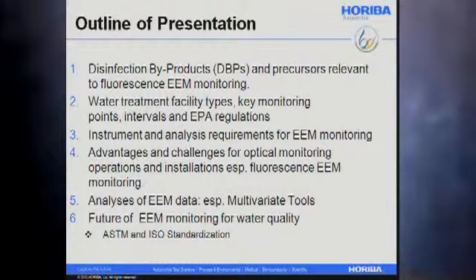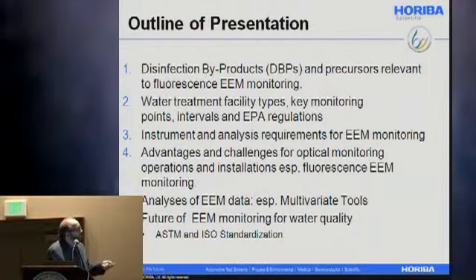Then I want to focus on the instrument and analysis requirements, because here again the recent improvements in technology have brought us forward and facilitated quite a lot of new applications. Then I'll talk about the advantages and challenges of this instrumentation, and focus on some of the analytical approaches for extracting quantitative and qualitative information from these instruments.